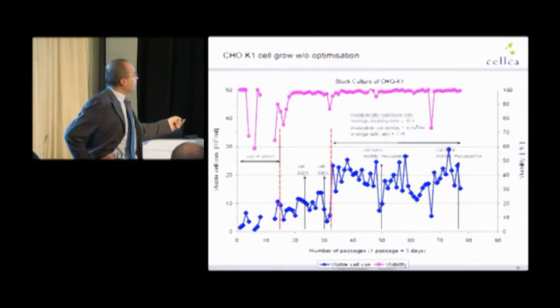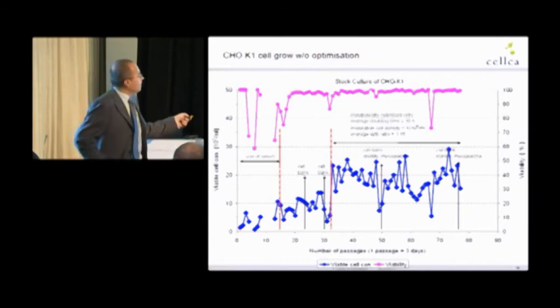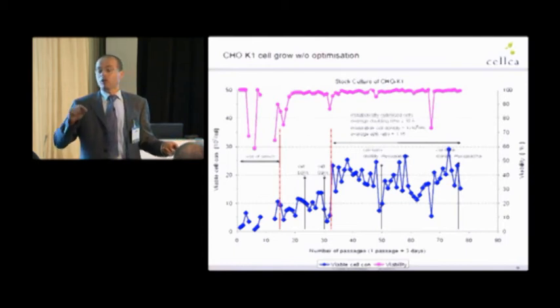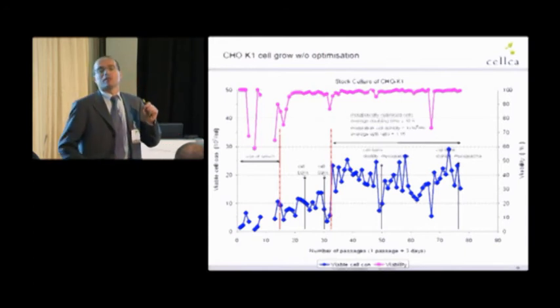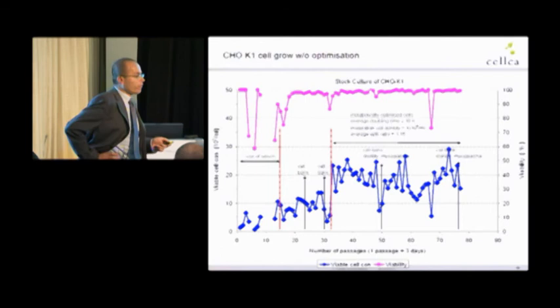Here we use serum. Later on, this cell line is adapted to serum-free conditions. What we see here is, even though every 3 days we split the cells with the same inoculation cell density, the cell line makes surprises. It goes up and down, goes up, down, down, up. That is horrible for large scale. First.